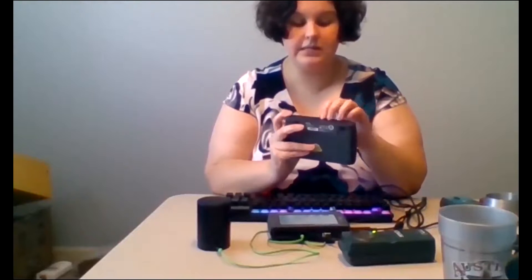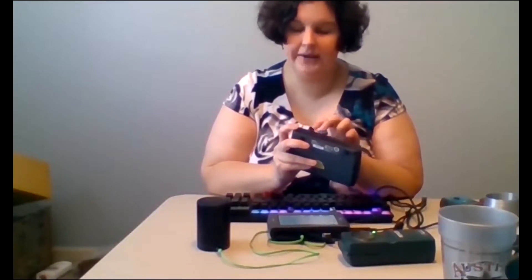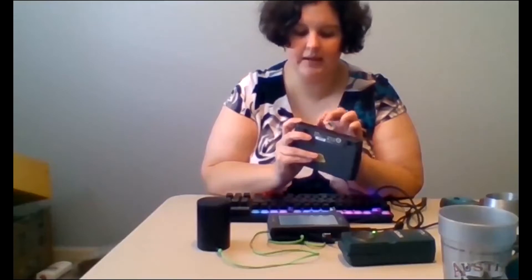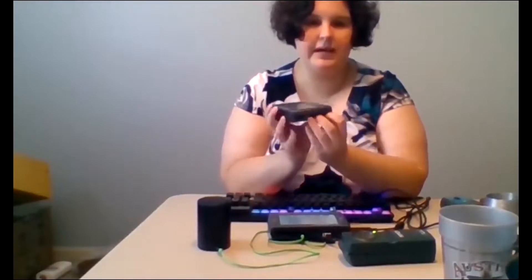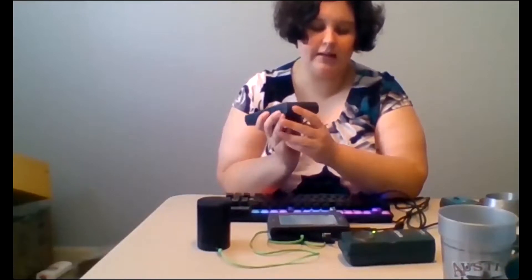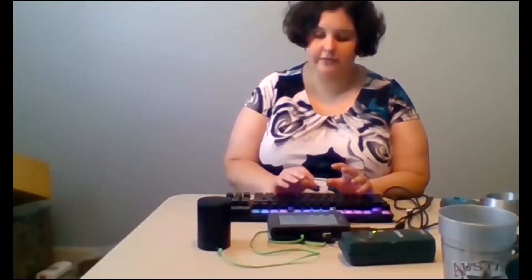There is a space with a little flap for digital sensors, and then a space for microphone and headphone ports. So if you prefer to have it personal or broadcast out to a classroom, you can do that. This is also good for students or users with hearing loss. On the left-hand side of the device we have three analog ports to plug in sensors, as well as a USB drive slot to plug in a keyboard. It is touch screen enabled as well as keyboard driven so you can choose whichever interface works best.